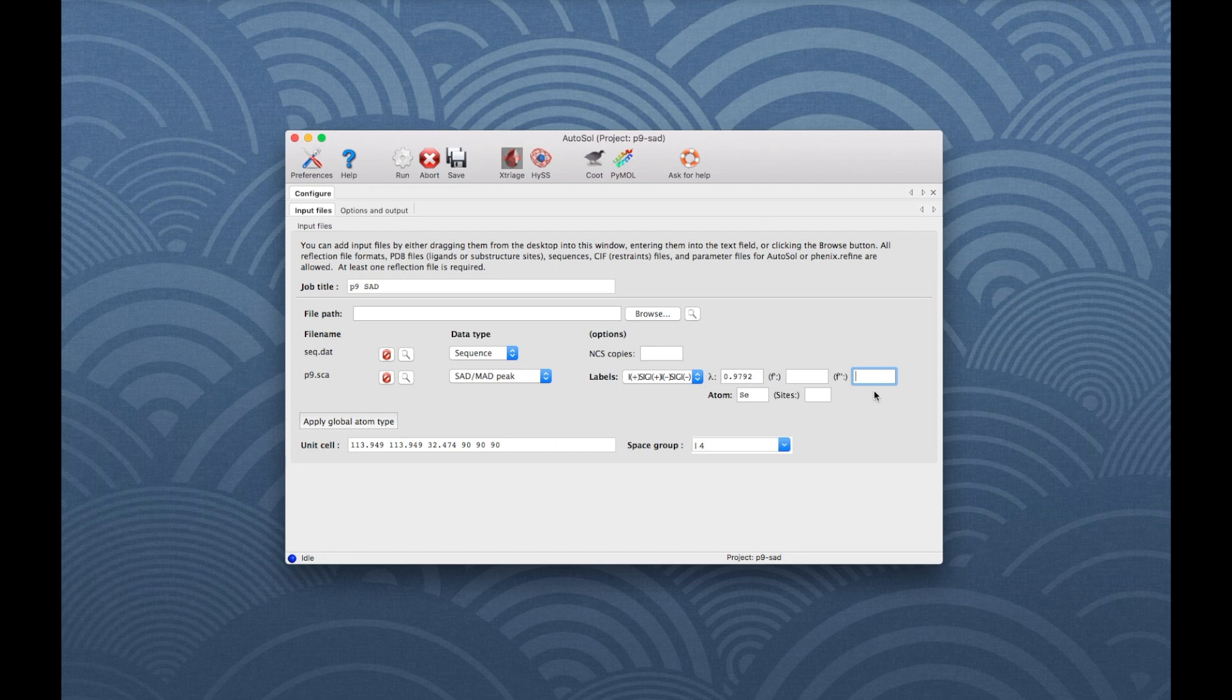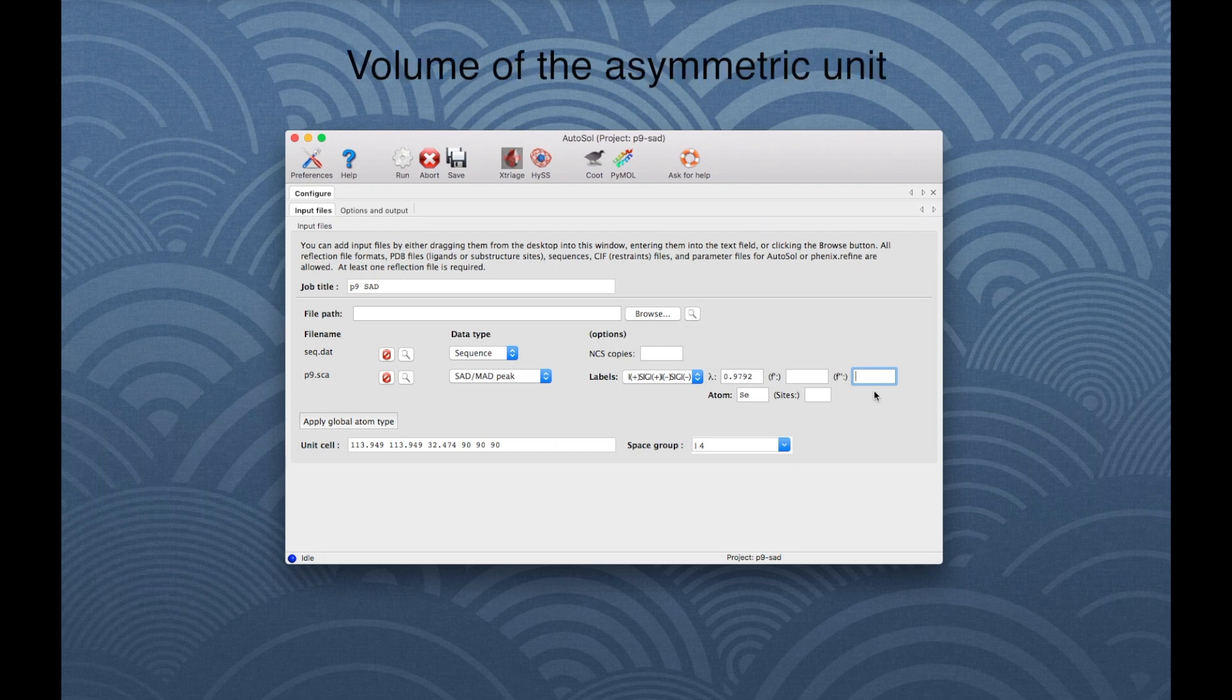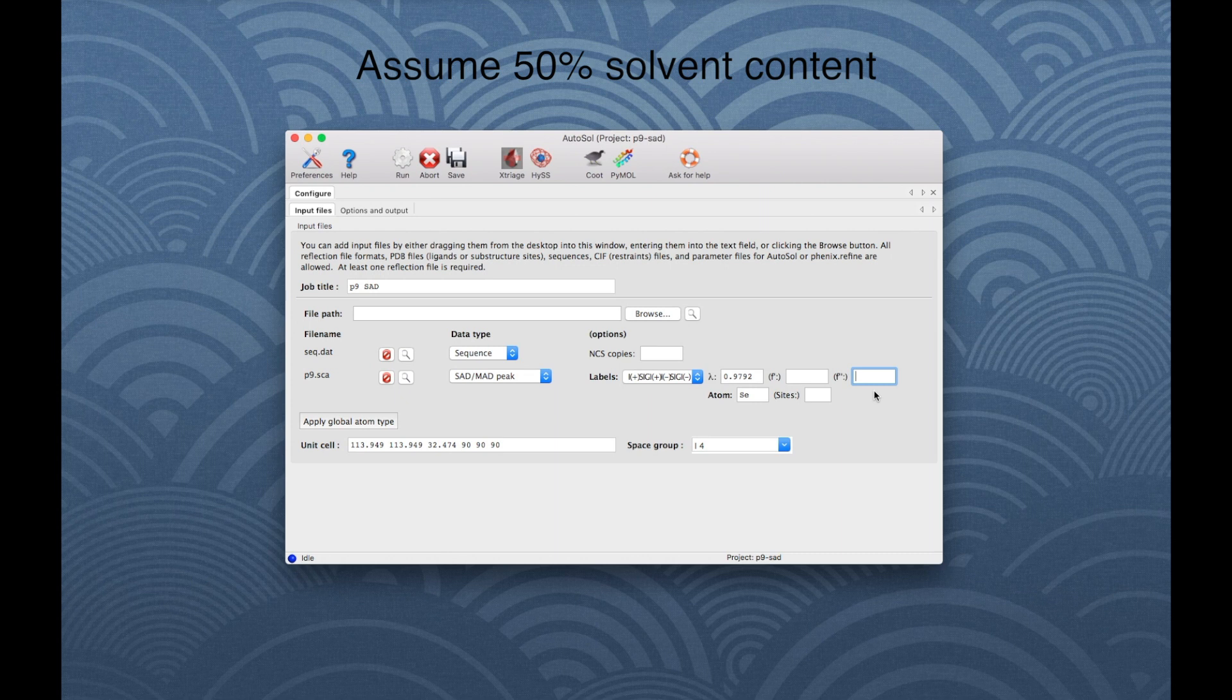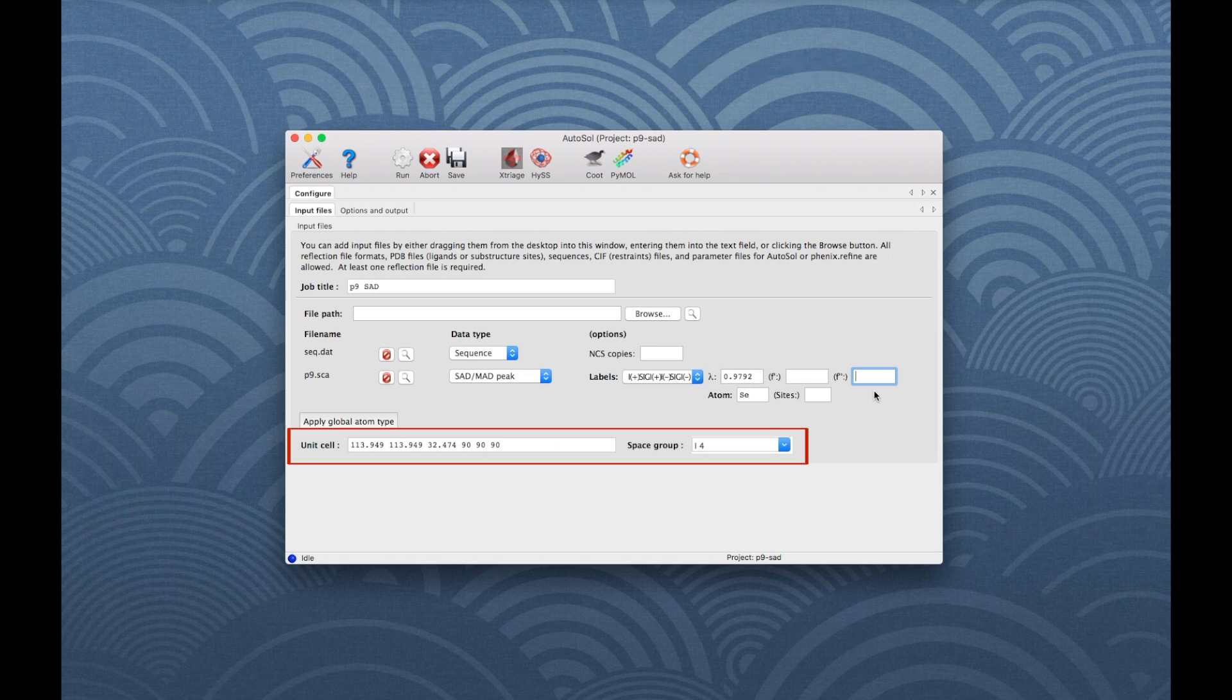We can also enter the number of NCS copies and sites, if they are known. Otherwise, the program will guess them based on the volume taken up by a molecule with the provided sequence, the volume of the asymmetric unit, and the assumption that about 50% of the crystal is occupied by the molecule. Finally, check that the unit cell and the space group match those of your data collection.